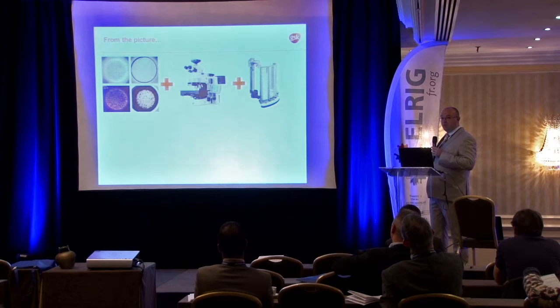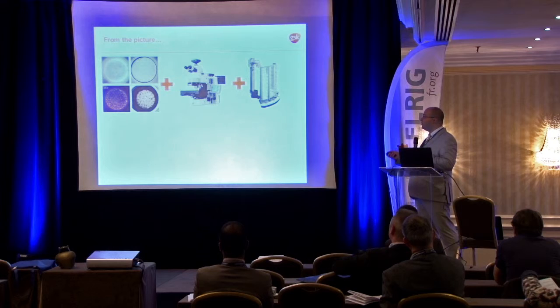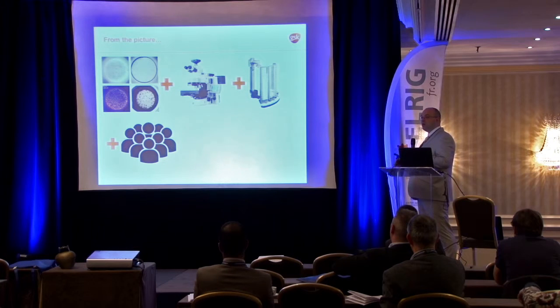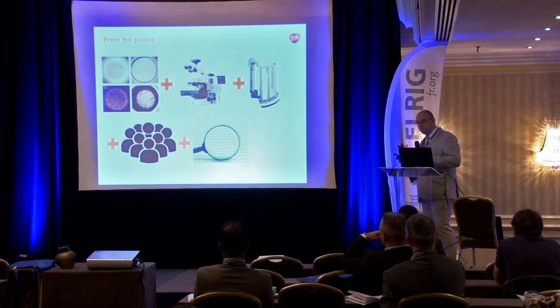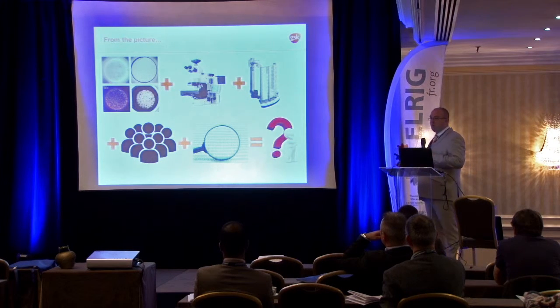You have to manage the robot, and the different parameters that you have to use for the microscope and so on. But when your system is well designed, a lot of people are using it because you have more and more tests to read with your system. And if you have more people using the system, you'll also have more data to manage. Everything together could really become a nightmare.